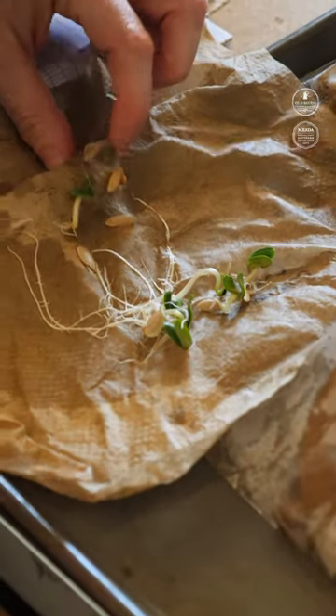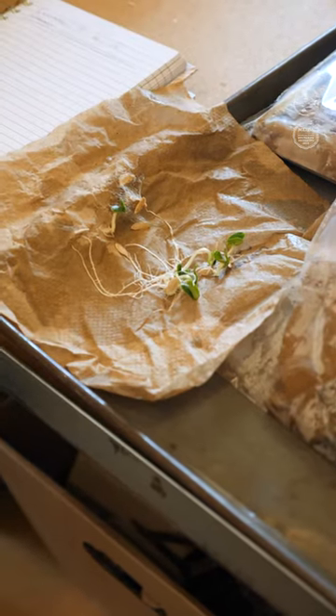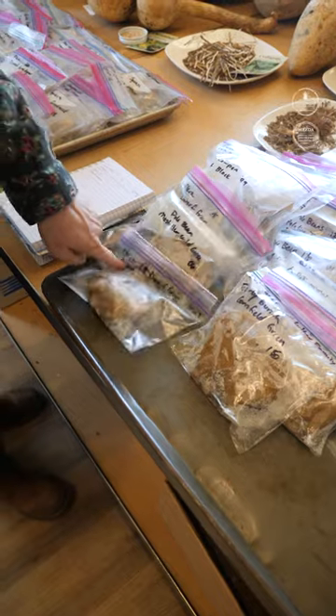Look at all those lovely seeds that have sprouted. I have 17 seeds in there that did sprout, and so that's what I'm recording. And this tells me that 85% of these seeds germinate, so that's what I would mark.